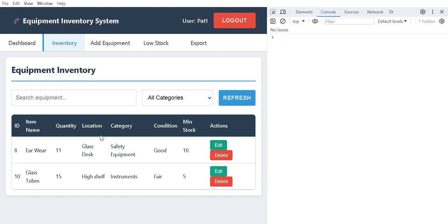This would allow administrators to manage inventory data while restricting access for other users. Since the system already includes a separate user table and authentication model, new permission levels can be added without restructuring the database. These design decisions ensure that the system remains flexible, maintainable, and capable of supporting future enhancements.